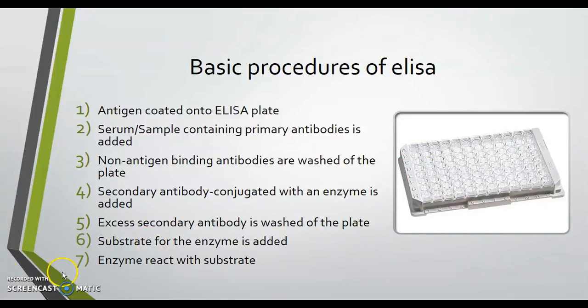And finally, the substrate, which reacts with the enzyme on the secondary antibody, is added in order to produce the final color of the reaction.